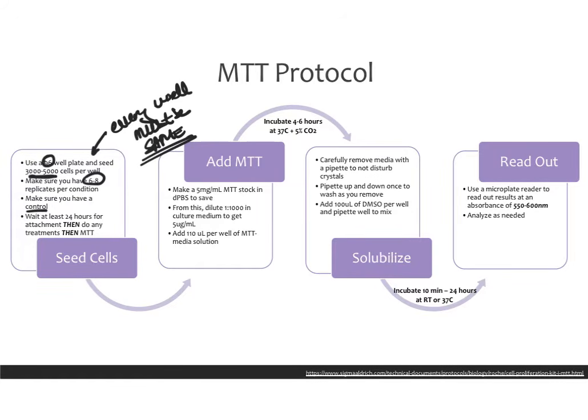Finally, before you actually add in the MTT reagent, your cells do need to attach to your plate. So if you've seeded them one day, you need to wait at least 24 hours, and then you would do any treatments that you're interested in doing, and then you would perform your MTT. So at this point, we're assuming that you've seeded the cells, you've let them attach, you've done any treatments you want to do, and you're ready to do your MTT.